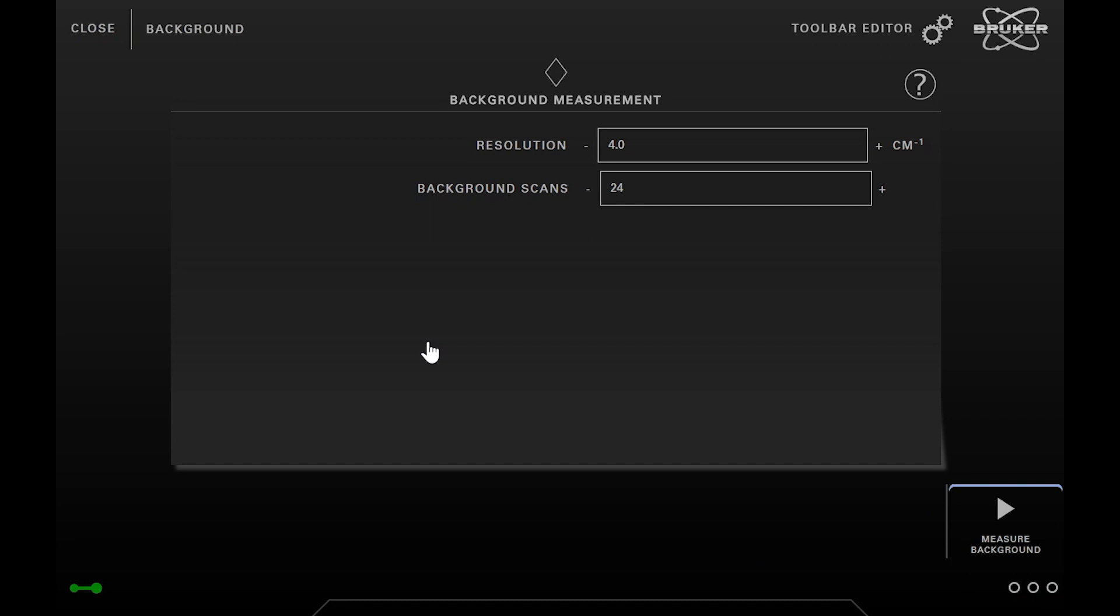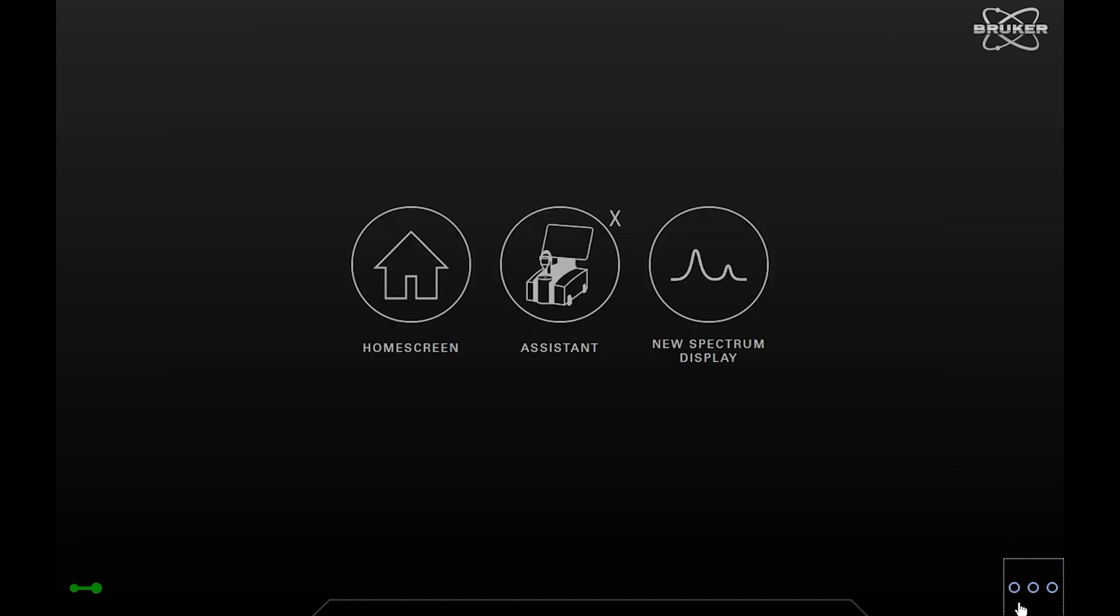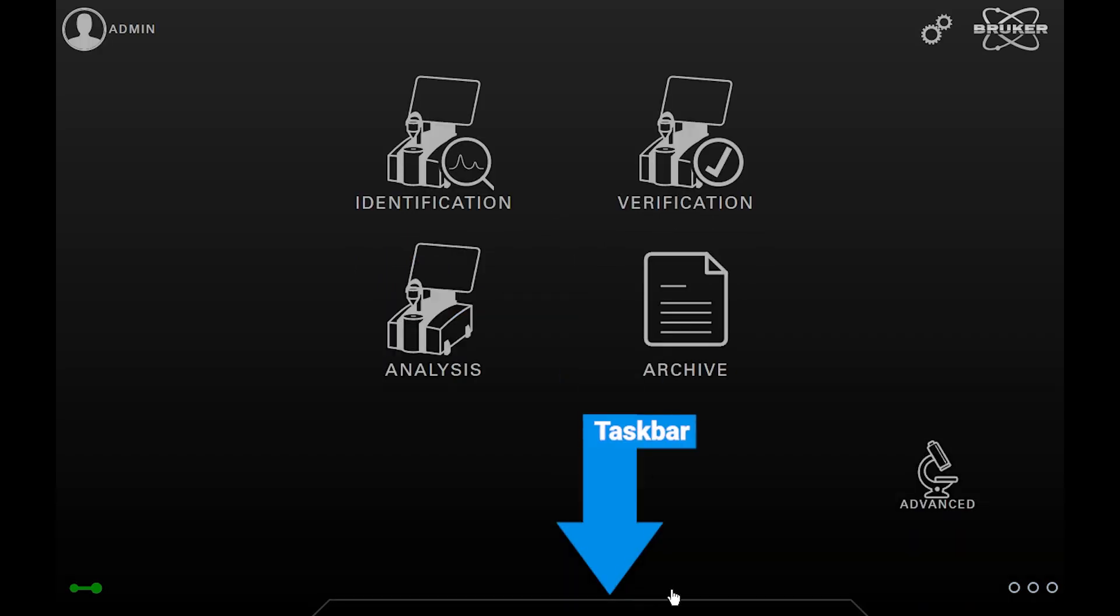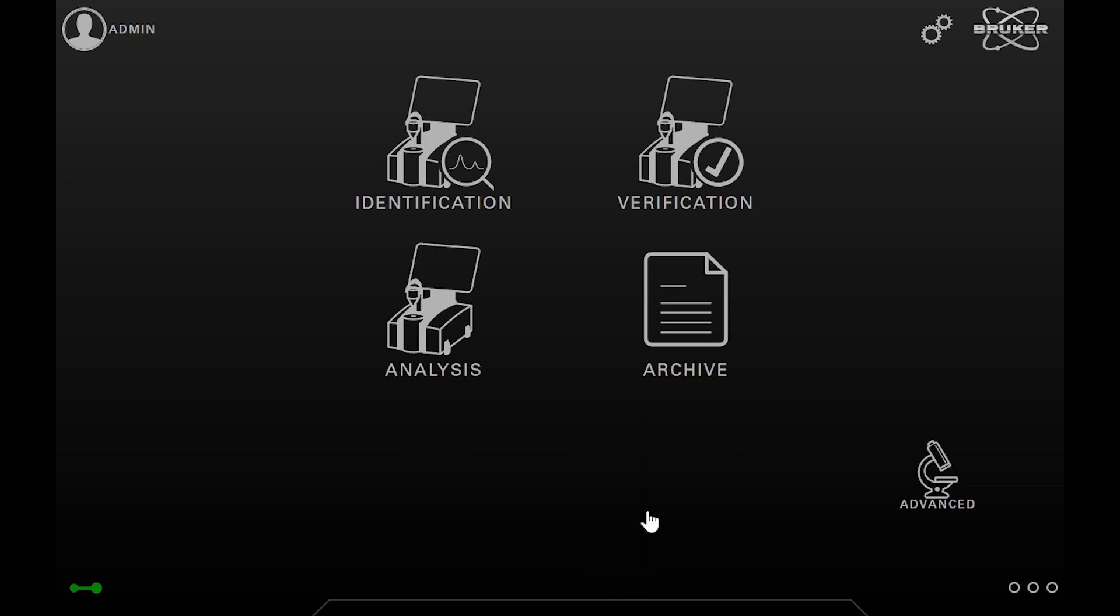Here you can see the task bar that shows currently running tasks. A task could be, for instance, a running measurement or an evaluation. Another point of interest is the so-called task list that allows you to see and manage running tasks.